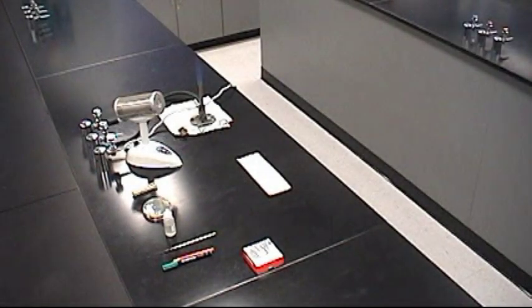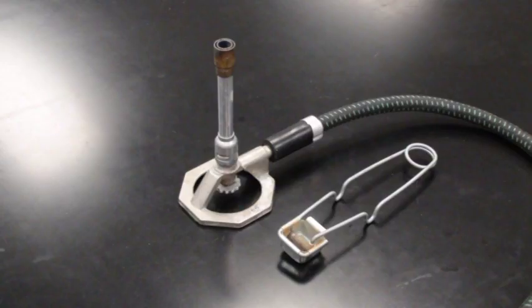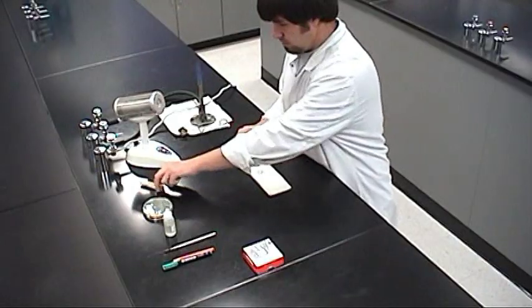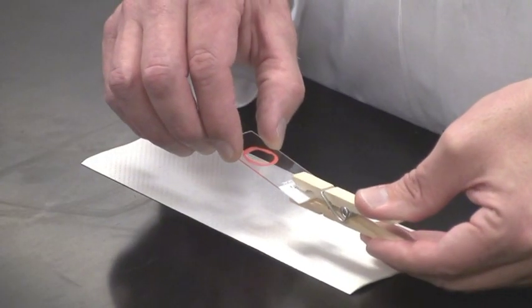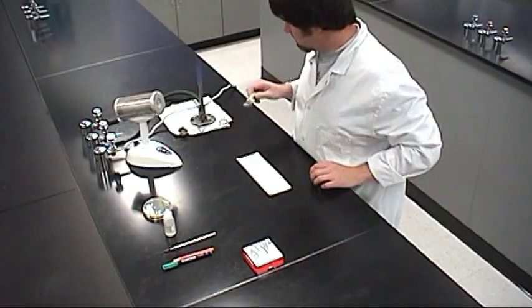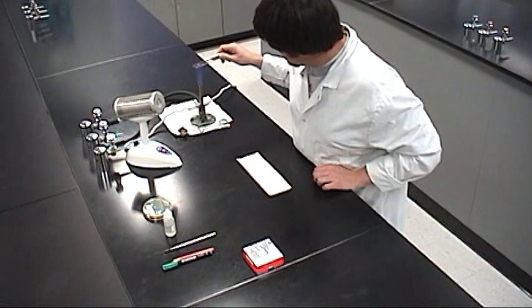To heat fix the smear you need a slide holder such as a clothespin and a Bunsen burner. First, attach the slide holder to the slide — pick it up and clamp the holder to the frosted end. Supporting the slide by its holder, pass the smear in and out of the Bunsen burner flame at the top of the blue cone, the hottest part of the flame, for one to two seconds per pass. Do this four to five times.